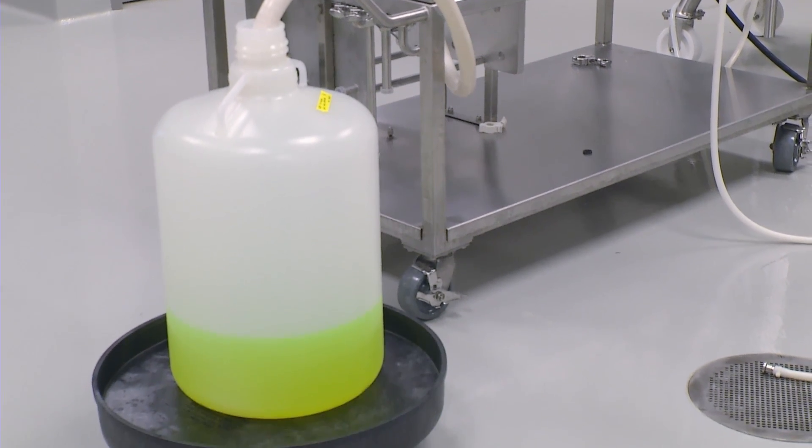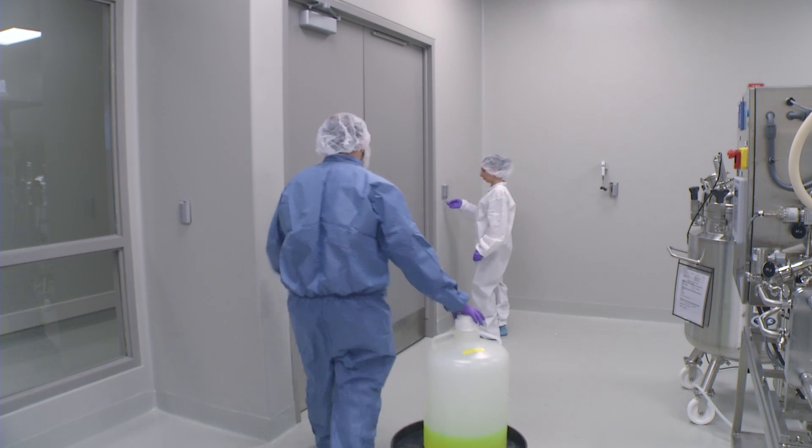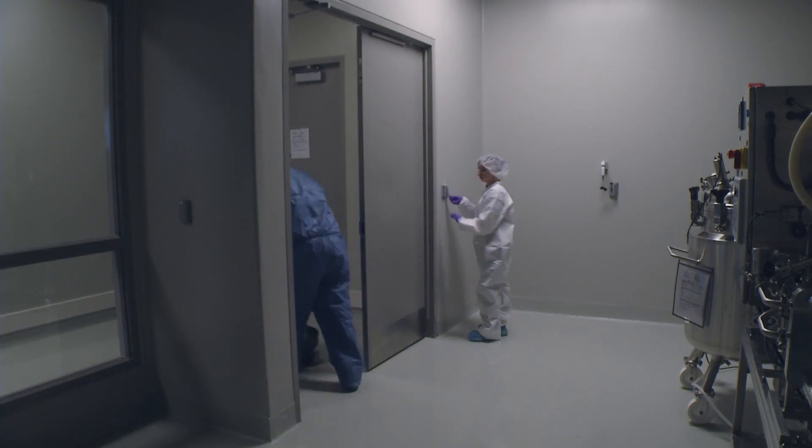The purification process is complete. The green fluorescent protein concentrate can now move downstream to final fill finish to be freeze-dried and packaged.